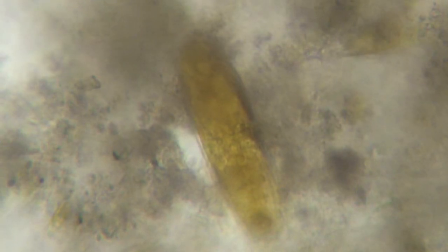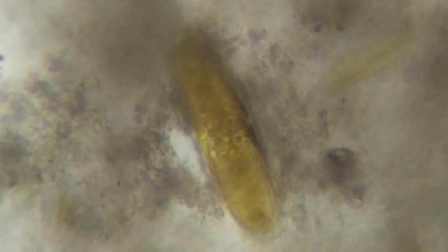There's a big blocky diatom with blunt ends. These are fairly common too, really big. And then a smaller one next to that. I see these quite a lot. So far, not much else. It's just so cloudy with debris.